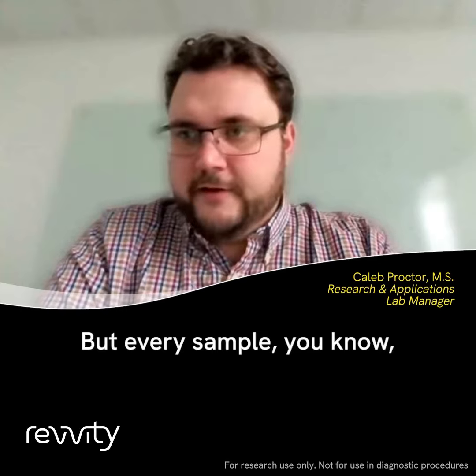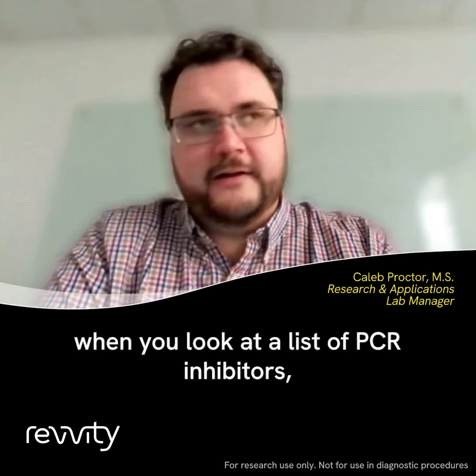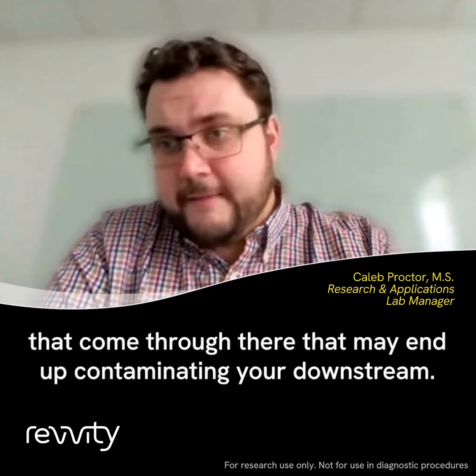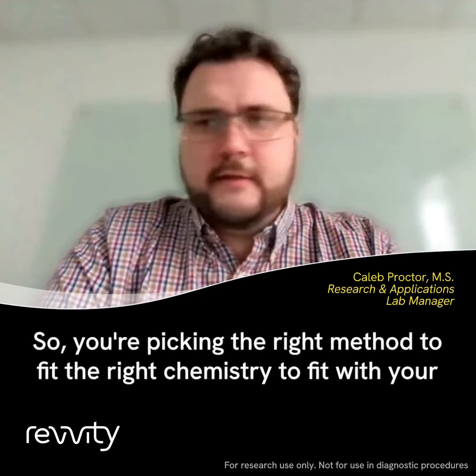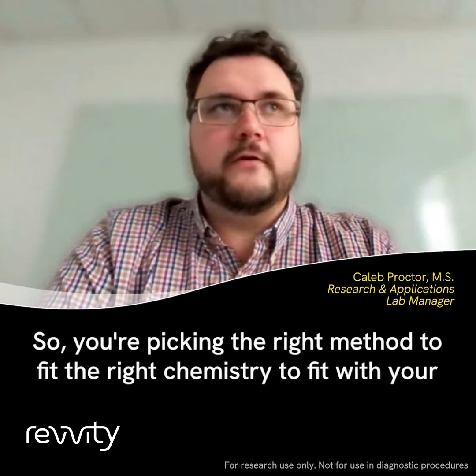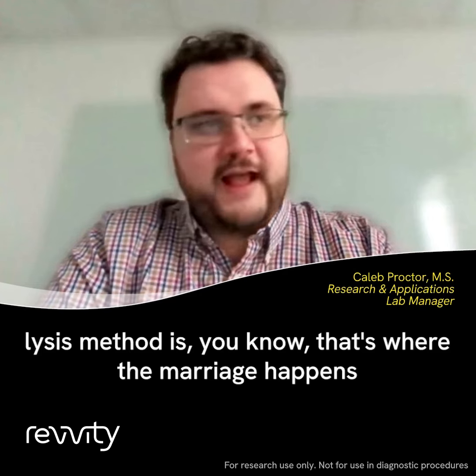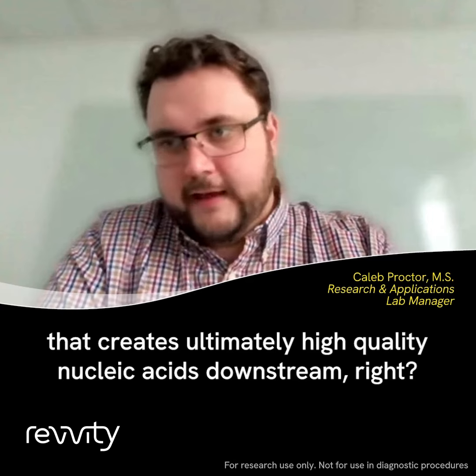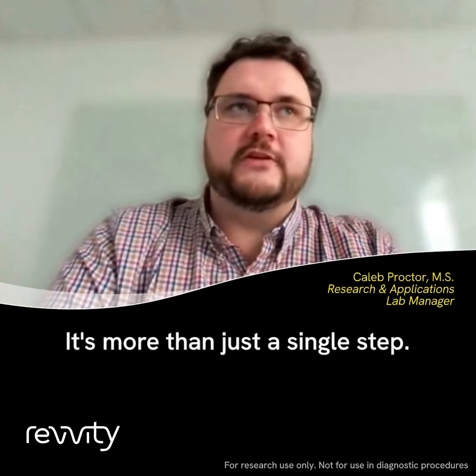But every sample, when you look at a list of PCR inhibitors, there's all sorts of things that come through there that may end up contaminating your downstream. So, picking the right method to fit the right chemistry to fit with your lysis method, that's where the marriage happens that creates ultimately high quality nucleic acids downstream, right? It's more than just a single step.